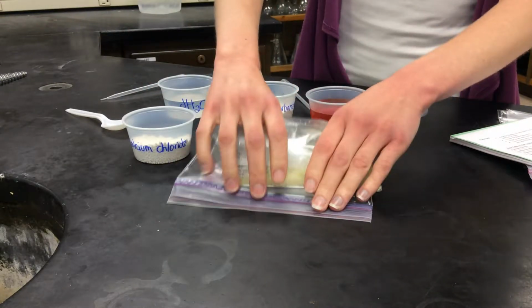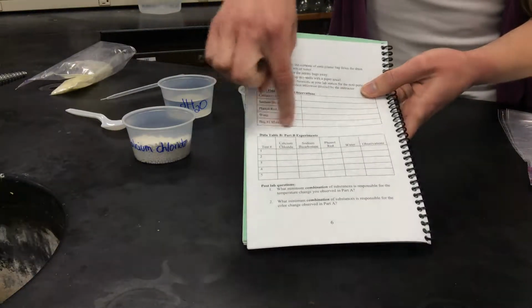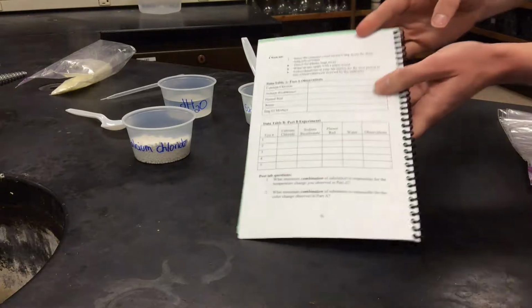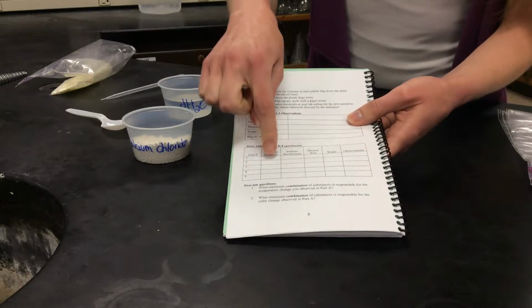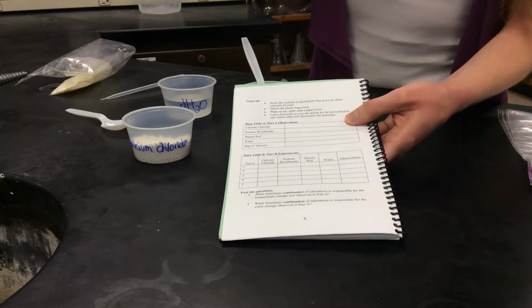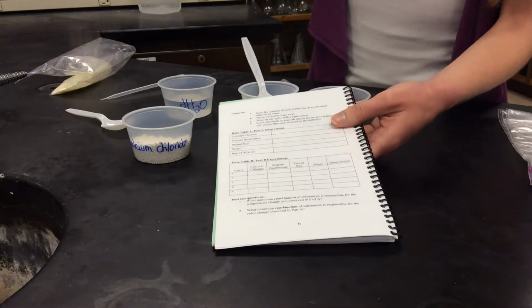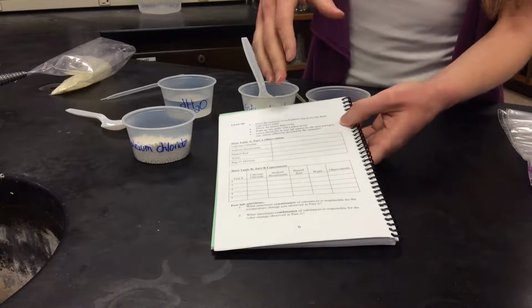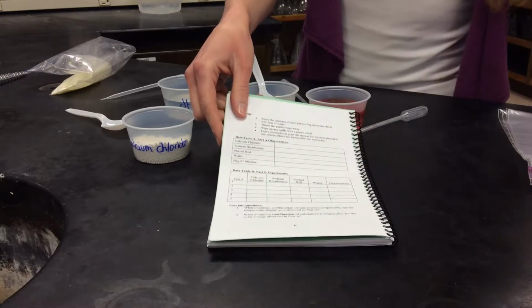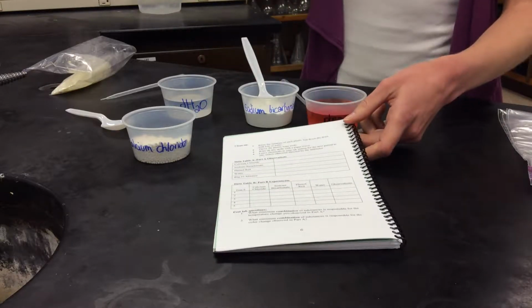Alright, so that is part 1. That is data table A. Now what we're going to do is we're going to do a series of smaller experiments. So this data table B is what we're going to be filling out now. And what our job is we need to figure out which chemicals are causing each of the changes we saw here. So we're going to figure out what is making the mixture turn warmer, and what is making it fizz, and what is making it turn yellow. Okay, so I am going to add different combinations to these different bags, and we will write down some observations. Okay, you just need to check which things I'm adding as I add them.